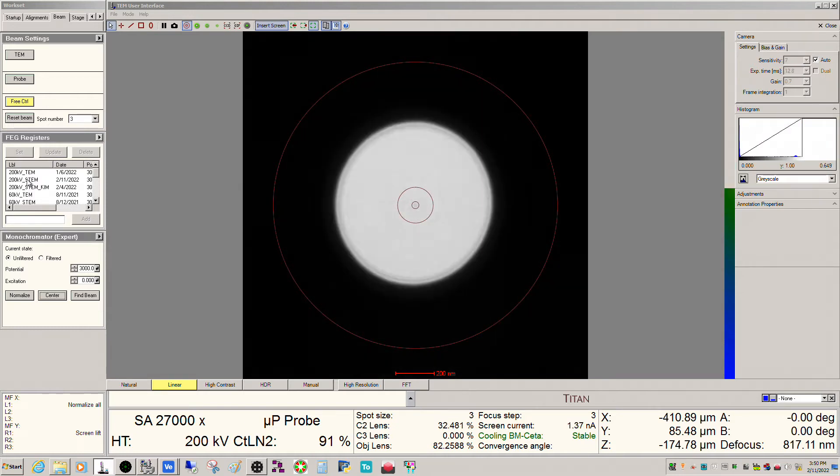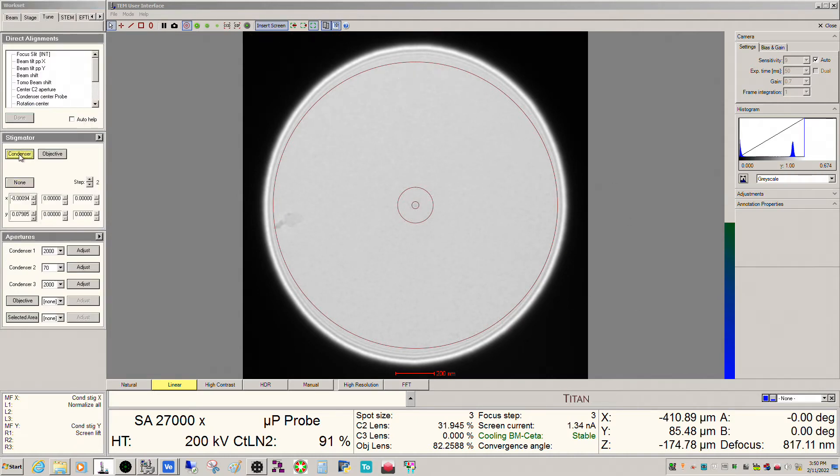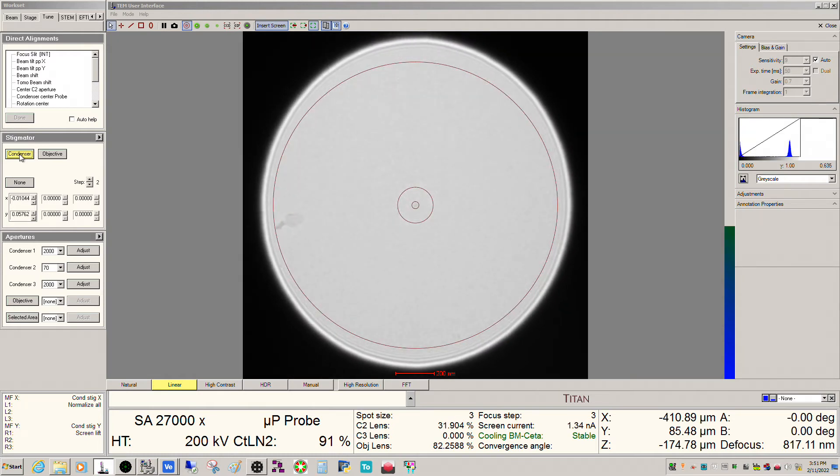I'm going counterclockwise from crossover here, which is what you want to do in this case with the C3 lens off. I've got a little bit of astigmatism here, so I can go ahead and correct that with the condenser just to make that a little more pleasing on the eyeballs. There are basically two things you have to adjust during your day-to-day operation with a monochromator with an X-FEG: the monochromator shift and the monochromator focus.